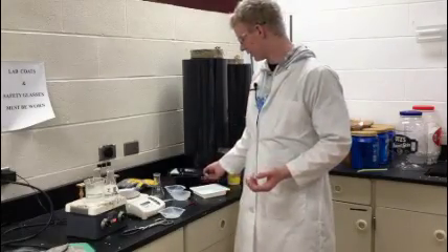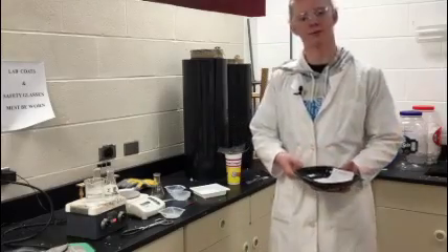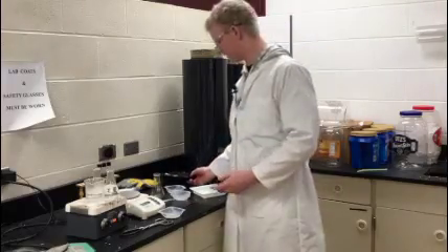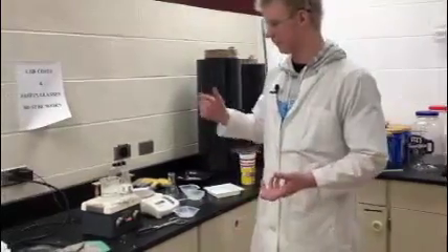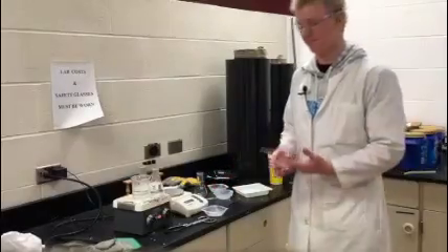Once you are done, you are going to want to put all your used pellets in a tray like this and make sure you put them in the correctly labeled one — we used PETE, so that is why I would put them there. Then you are going to want to unplug the hot plate, make sure all your glassware is clean, and put it all away.